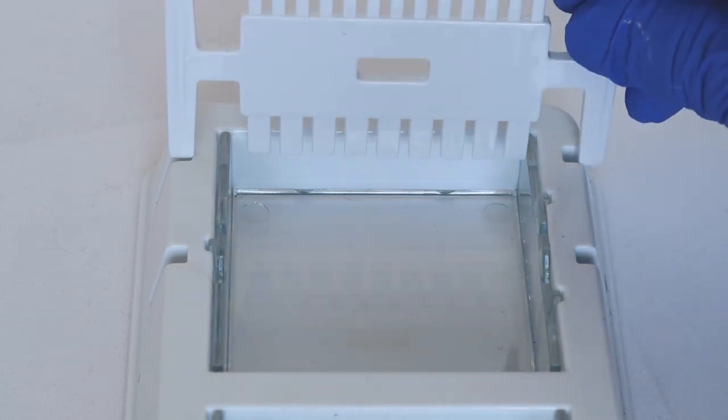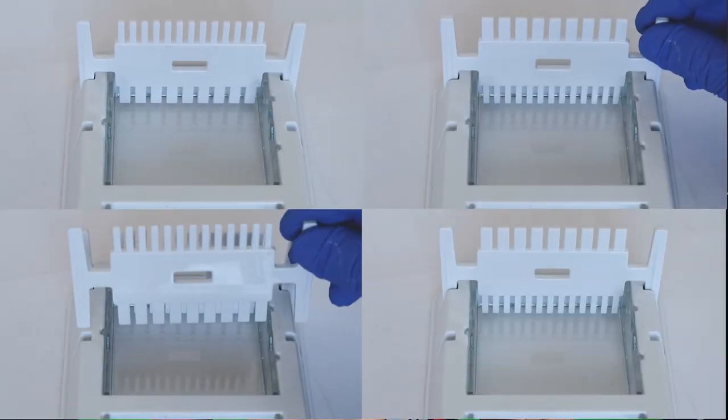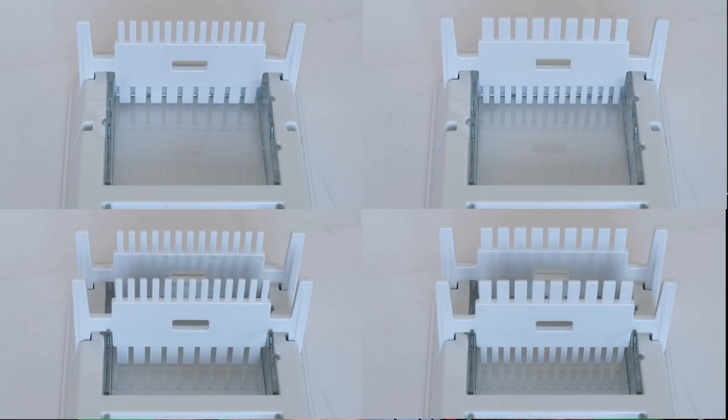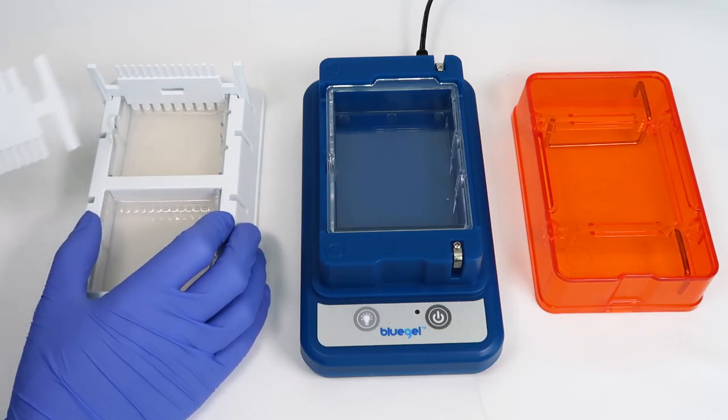The two-sided combs give you the ability to create gels with 9, 13, 18, or 26 lanes, and the small gels will set after just 10 minutes.